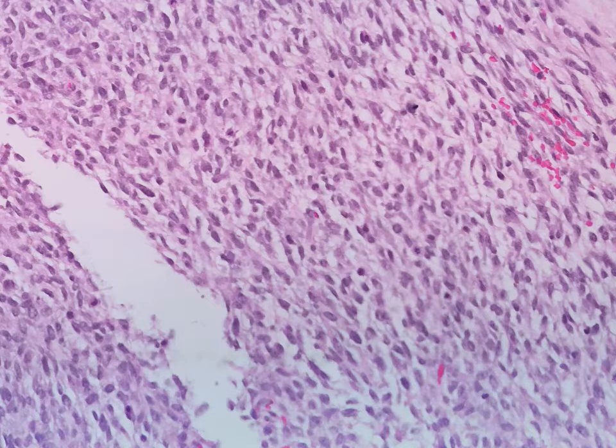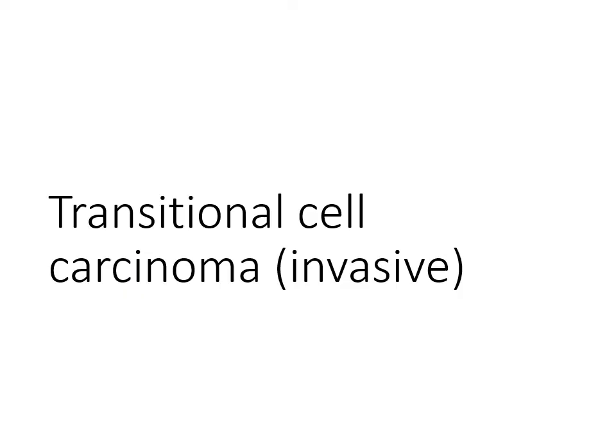Again, this field is the same. It is just the blastema component of the Wilm's tumor. Next, we go to transitional cell carcinoma, or in this case, the invasive type of transitional cell carcinoma.